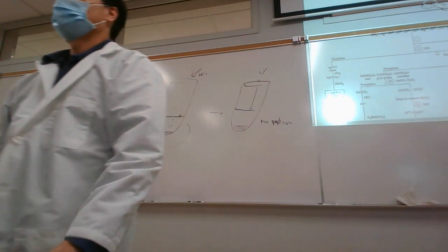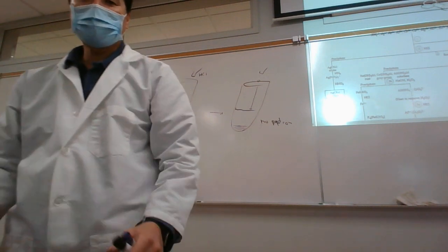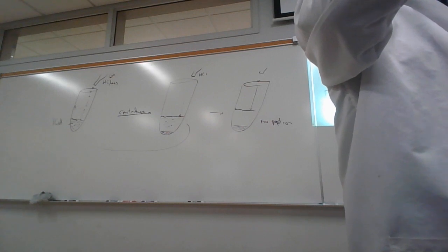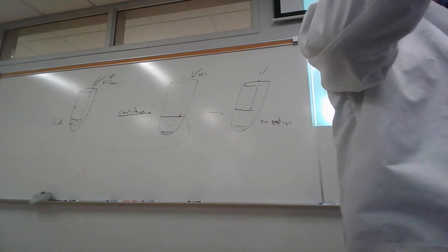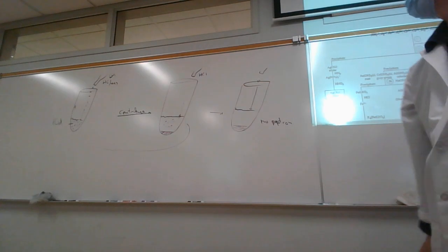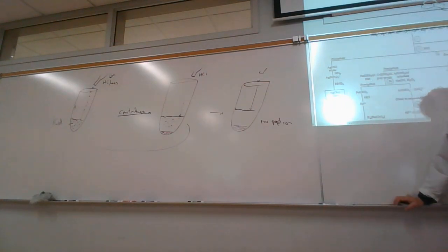You have to balance the centrifuge. Yes, you have to counterbalance the centrifuge. So you're going to take one test tube. Let's say you don't want something this full, and then fill a blank. That is, fill an empty test tube the same height with just water, DI water, and that'll balance it. Otherwise, it's going to start rocking, and you'll hear it too. It's going to make a lot of noise. It'll be really fussy.